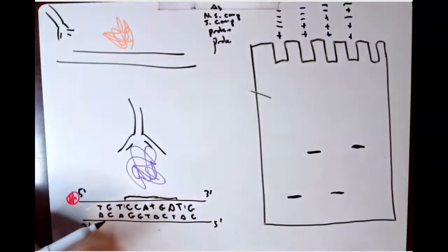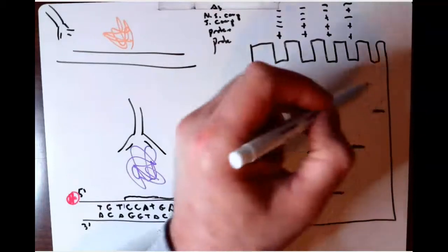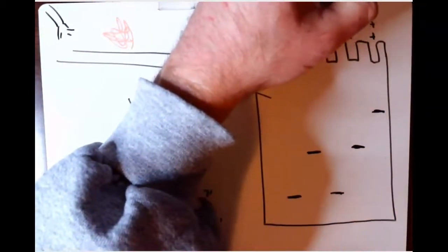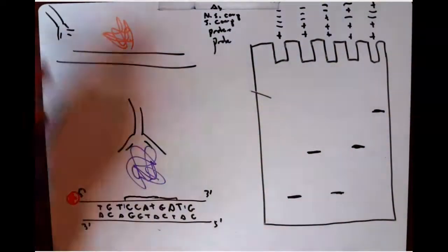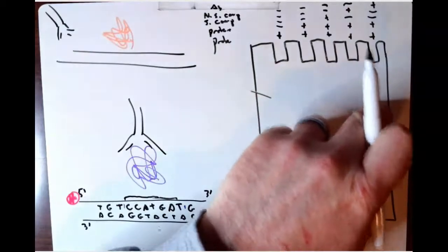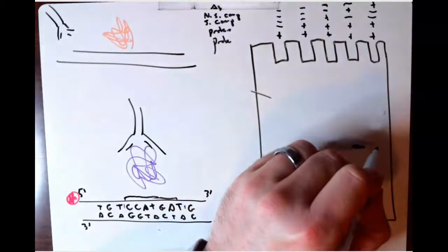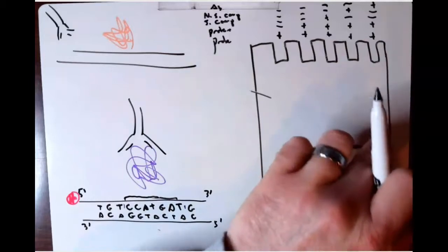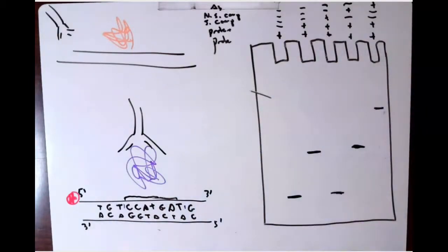This is much bigger in volume and surface area and in mass, and it should cause a super shift when we have our probe, our protein, and the antibody. A super shift. However, if it was contaminating, then we would have no antibody bound to the complex. This complex would be the same size as before. This would be the result that would indicate a negative result. In other words, that it was a contaminating protein carrying through. But what we expect to see is the super shift.